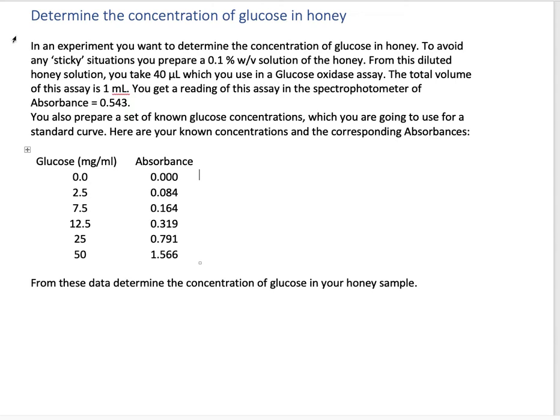We have an experiment in which we need to use our skills with standard curves and dilutions to determine the concentration of glucose in honey.